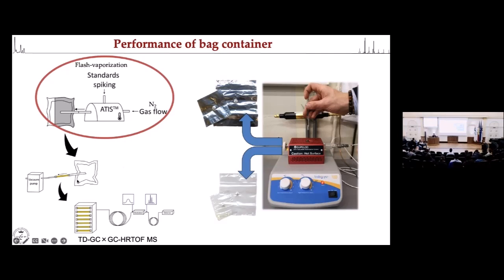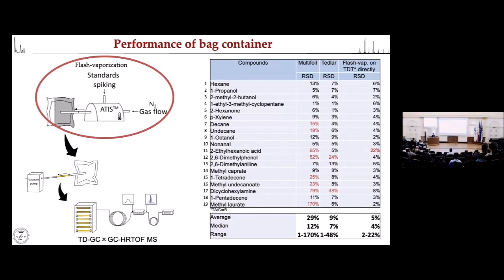After that, we transferred the content of the bag into the thermal desorption tube, and then we analyzed them in our dual stage thermal desorption coupled to a GCxGC with high resolution MS. And this is what we got.